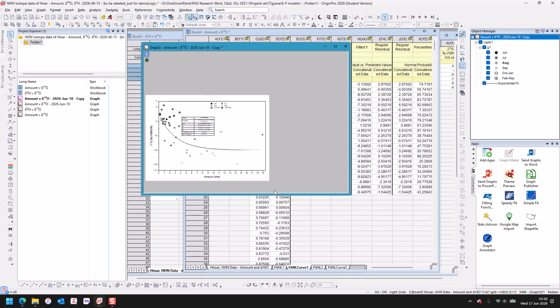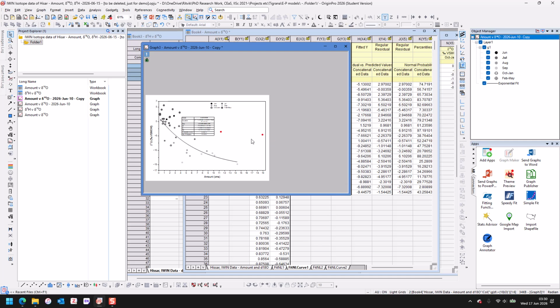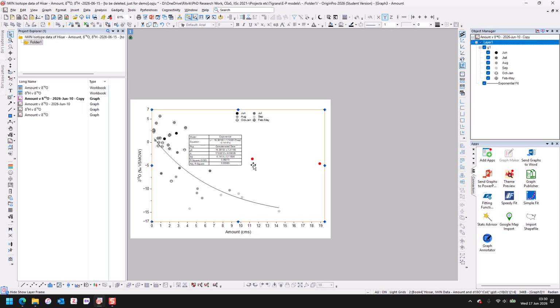Okay, this time I'm gonna mask this. Yeah, I think it's gonna change. The mask. See, the graph has changed. Right. Interesting.